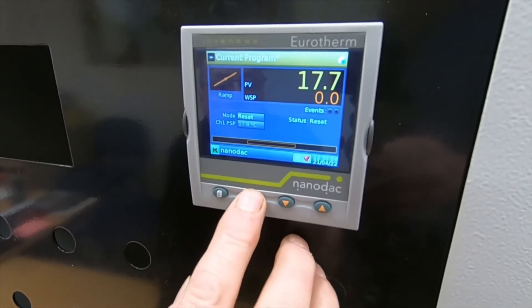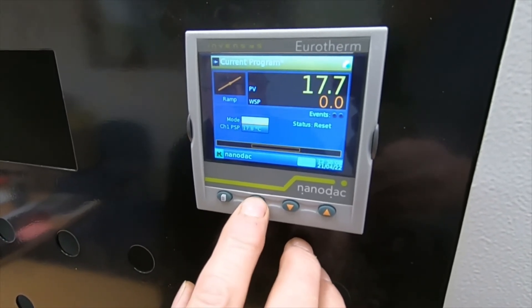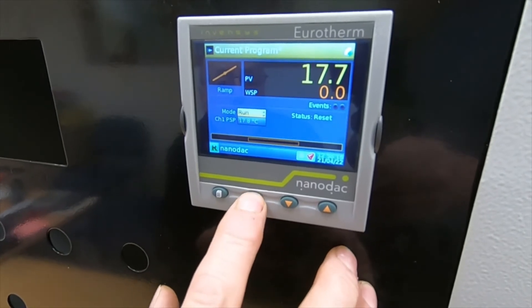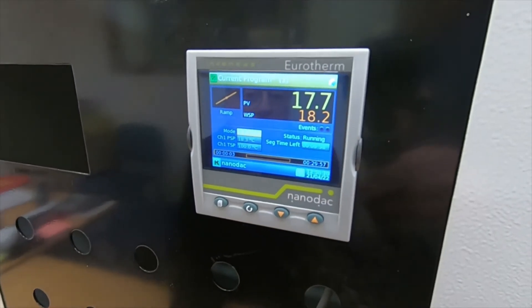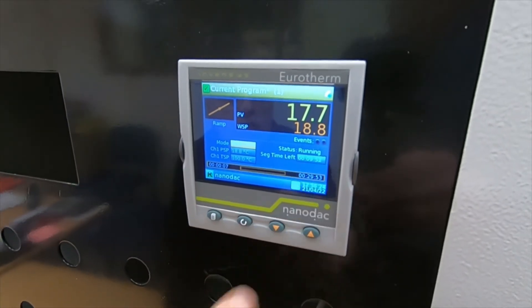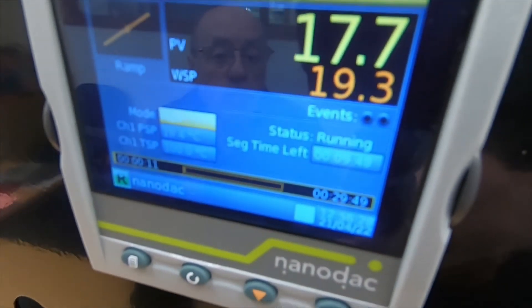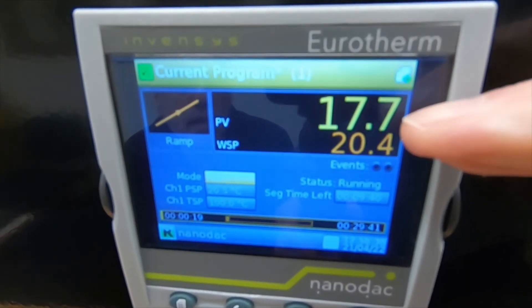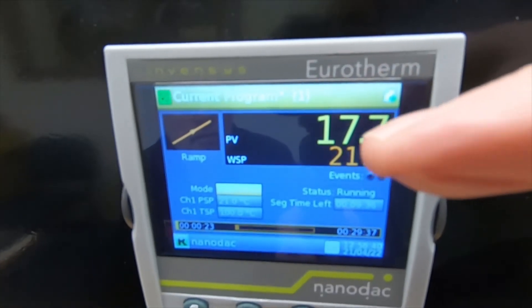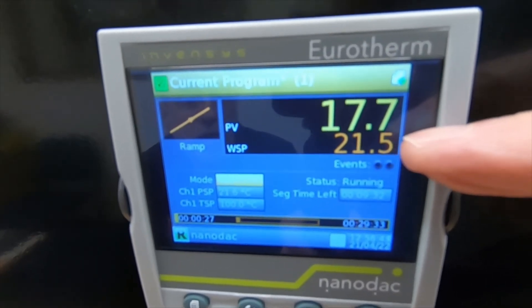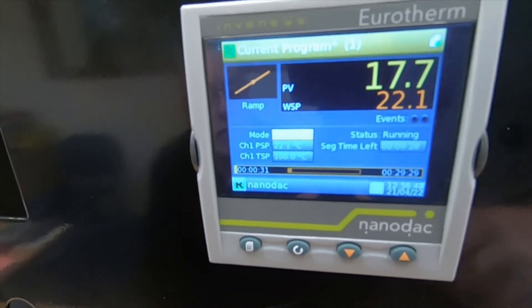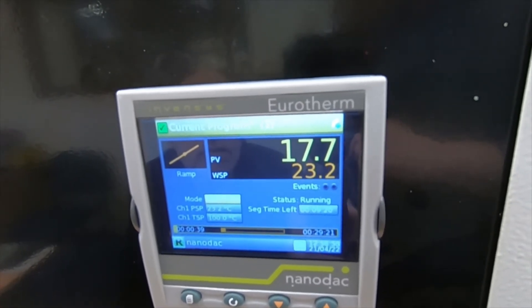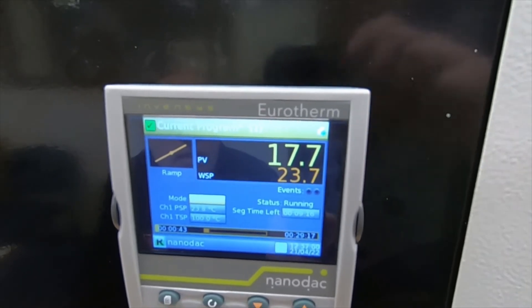If you want to run the program, use your scroll button to highlight reset, then press it again. The reset has turned to black letters. Select run and press your scroll button. Now you can see the time running — segment time left 9 minutes 53. At the bottom is your total run time: 29 minutes 47 seconds, because you've got your dwell in there as well. We're seeing the actual temperature in the theoretical oven and the temperature the oven is trying to achieve, currently ramping up. It will ramp up to 100 degrees in the time set — 10 minutes.